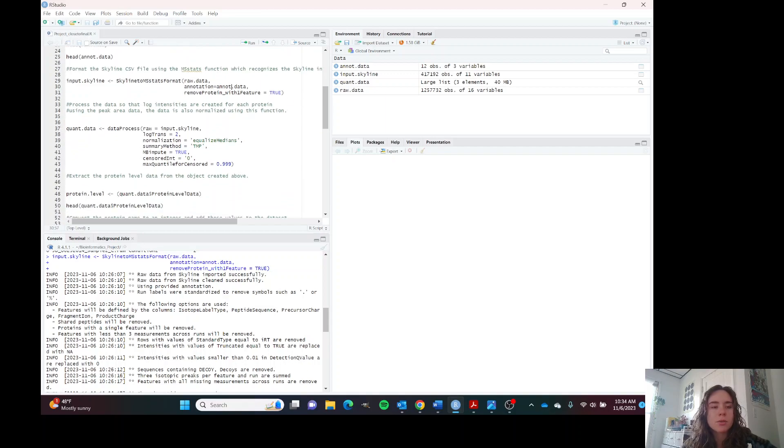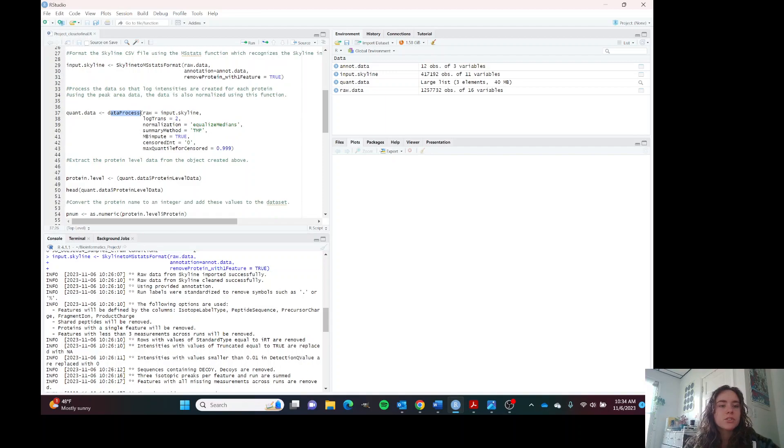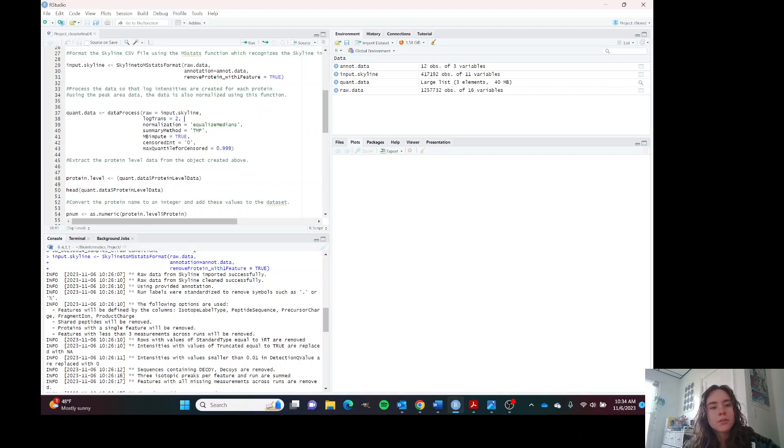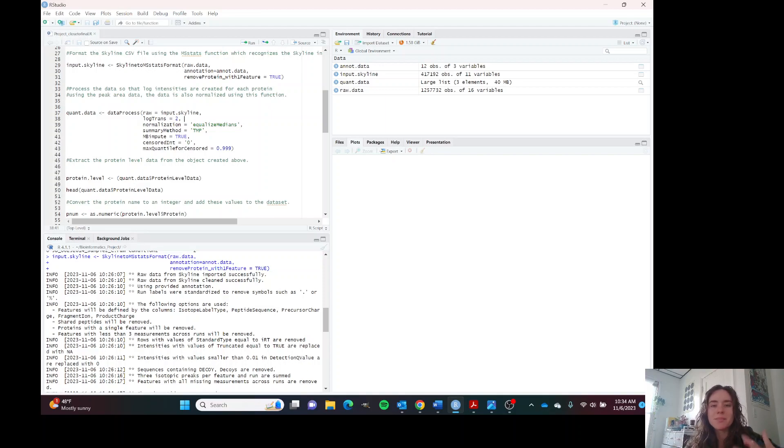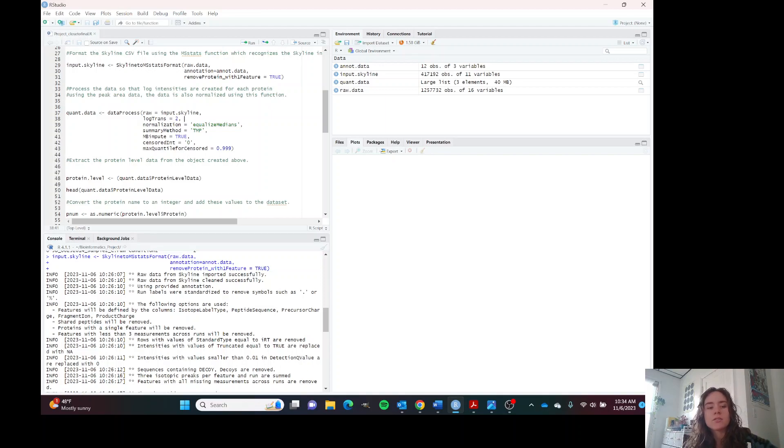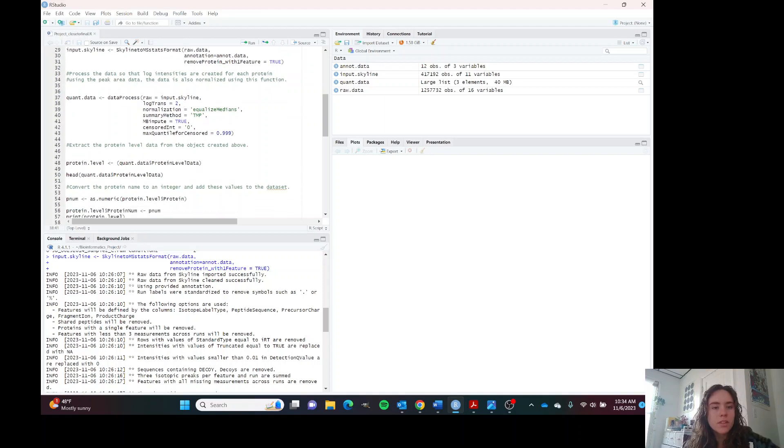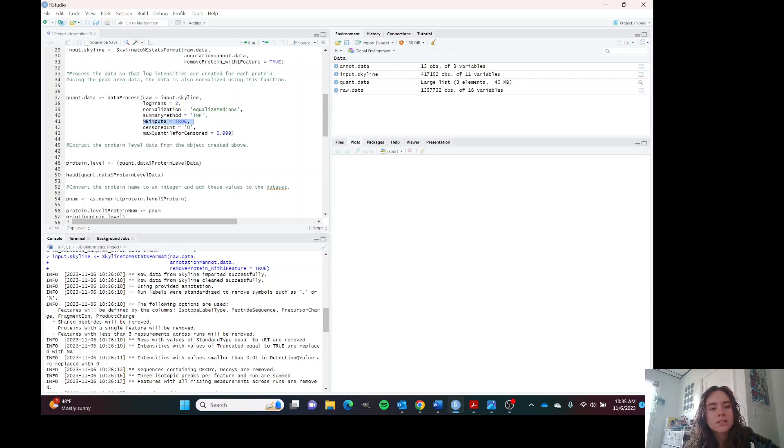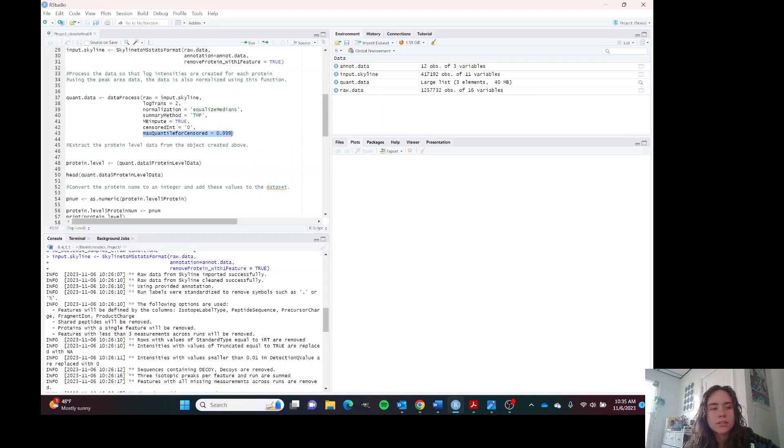This is our data processing function. We have our skyline process data. We're going to transform to log two for the intensities. We're going to normalize using equalize medians. This equalizes the medians across all conditions and allows us to assume that all conditions have the same median. This TMP is a summary method and requires this argument. Skyline requires that we impute zero and the max quantile is this default.